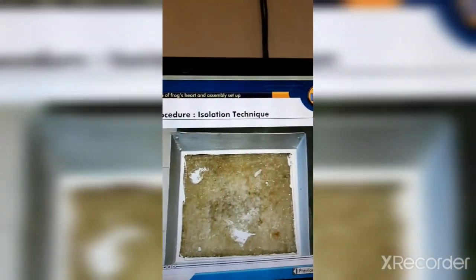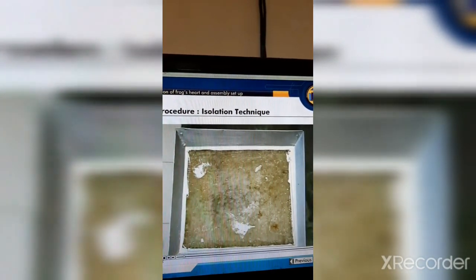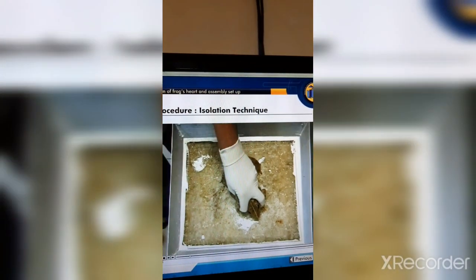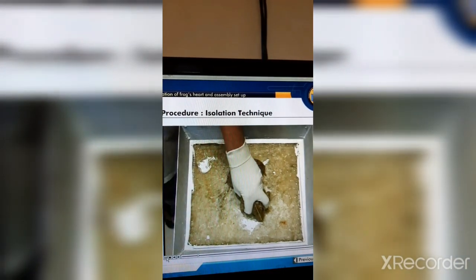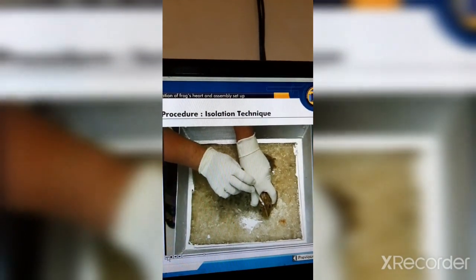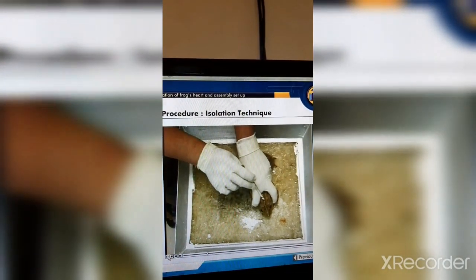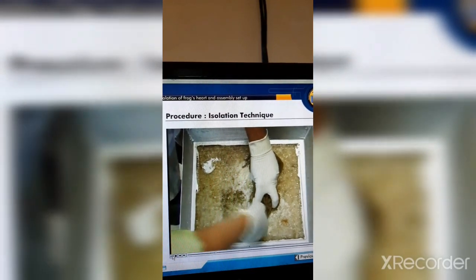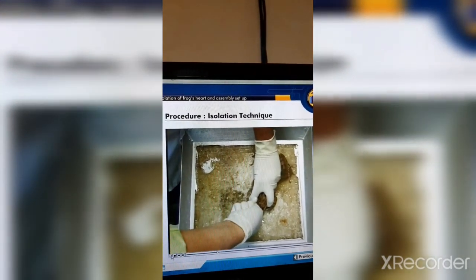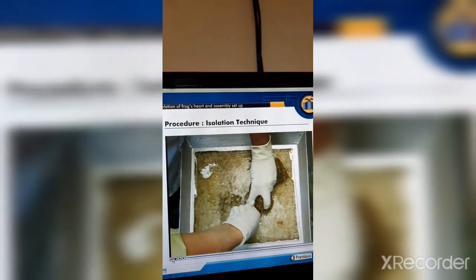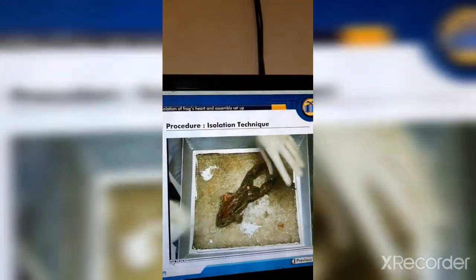To know the effect of drugs on frog's heart, it is necessary to isolate and perfuse frog heart preparation with frog Ringer solution. Always select a healthy frog of either sex. Pith the frog with the help of a pithing needle. Identify the pithing spot on the dorsal central surface of the skull. Feel the cavity and then insert and rotate the pithing needle by around 45 degrees to and fro. This leads to breaking of the connection between brain and spinal cord. Such a frog is used for experimental purpose as there is no sensation in it.